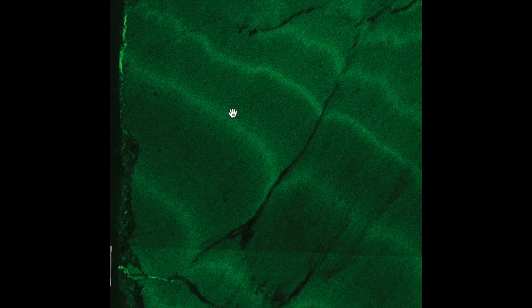And just to relay the importance of the fine scale to you all, I'm going to show you an image of fluorescent banding within the stalagmite sample. So what you're looking at here are essentially annual cycles of rainfall within the stalagmite sample. So you can think of the bright green bands as representing heavy rainfall periods, so essentially the summer season, while the darker bands are periods when there is not as much rainfall, so it's the rest of the year. So each time a bright band bounds one of these dark bands, this is a 1-year cycle.